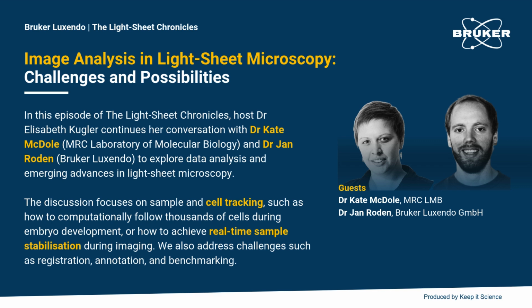Thank you so much for those insights. I think we spoke about loads of things today, like only keeping the good data and optimizing the acquisition, which is also a lot of AI work happening, but also what we spoke about at the very start, keeping sparse data and removing the empty pixels, probably one of the main challenges to be solved at the moment. So thank you so much both for bringing that in as well. But unfortunately, we have to start wrapping up.